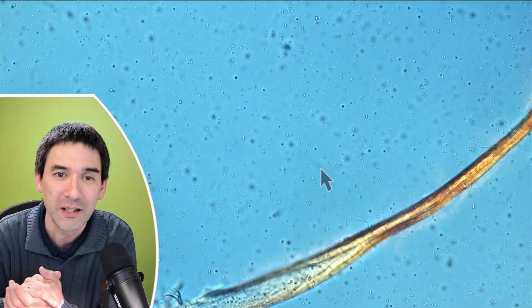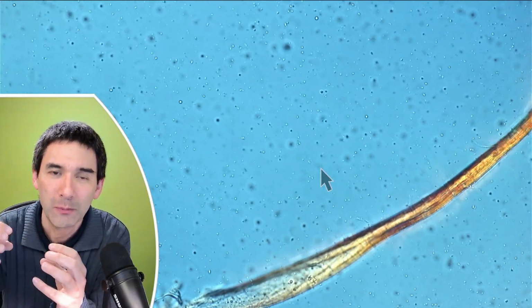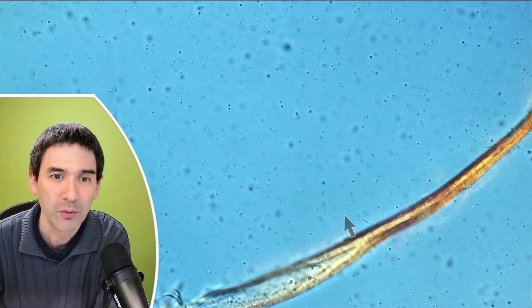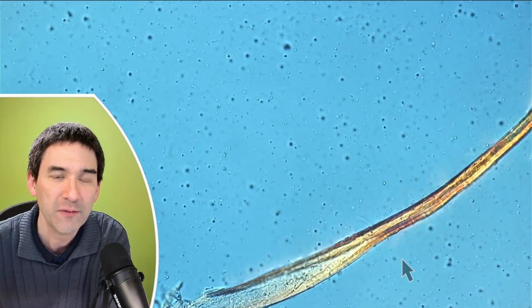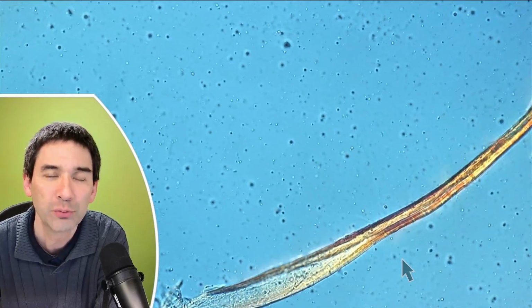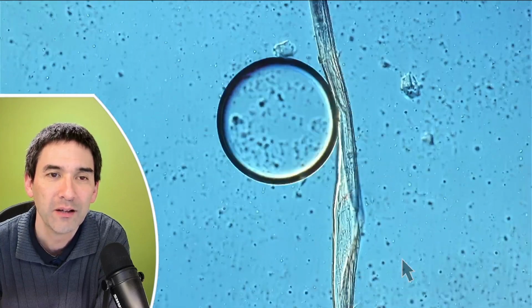And look. Again, a directional movement, usually when some kind of a bubble collapses somewhere, or two bubbles combine, and this can cause a directional movement and a streaming motion here, right? So, but let's move the arrow a little bit out of the way again. But because those fat droplets are significantly smaller, their Brownian motion is a little bit more pronounced here, right? So, if you just look around here, again, look, an air bubble and some kind of a contaminating fiber, it doesn't really matter.